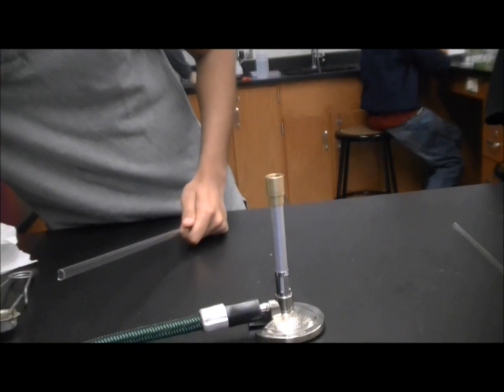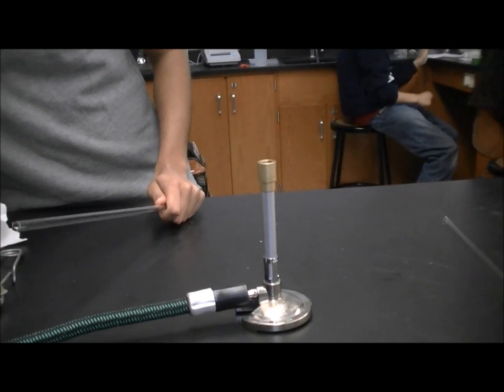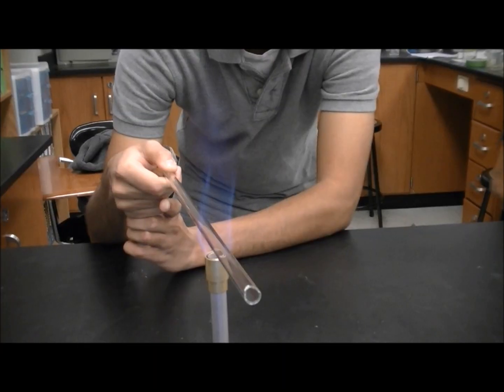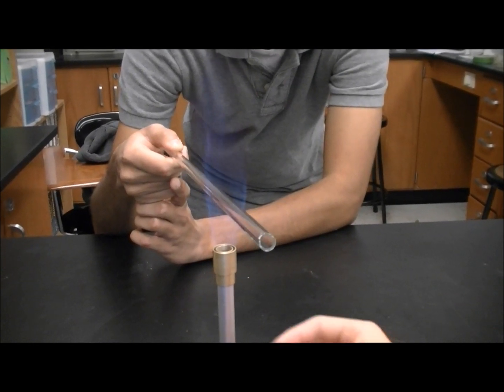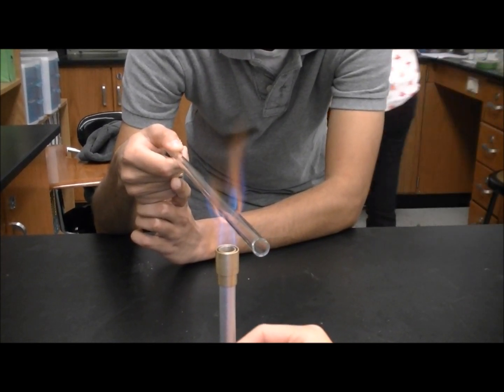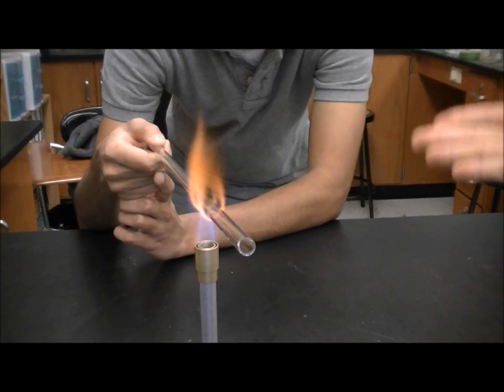I'm going to start the gas over here. Did you turn on the gas? Yeah, I can feel the gas. I'm going to light it. And then hold it right above the blue flame — like, don't put it in the blue flame.